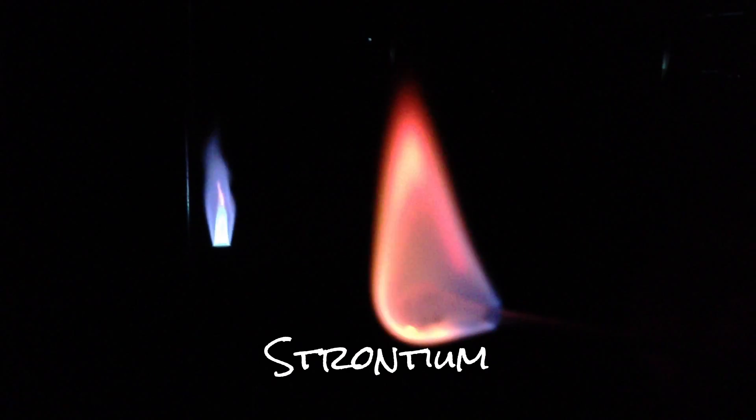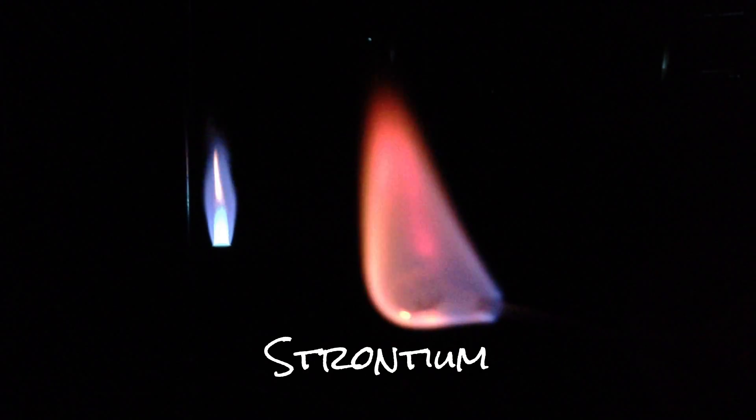Here we have our strontium. Same thing — I'm taking a cotton swab, wetting it in methanol, dipping it into some strontium chloride, strontium ions. Here we go lighting it up, and there's my strontium — a little different color there. There's a little bit of blue on the back, and that's due to probably the methanol burning.